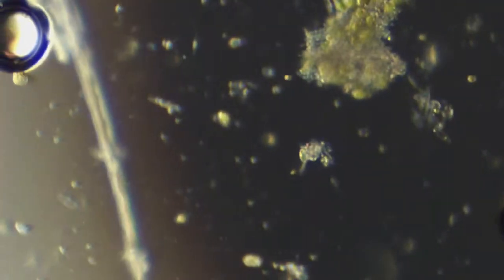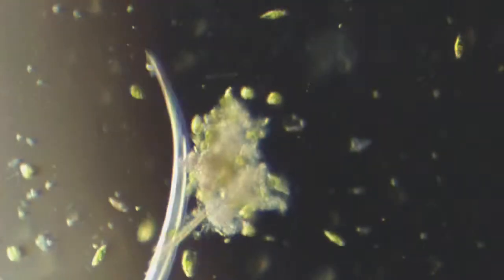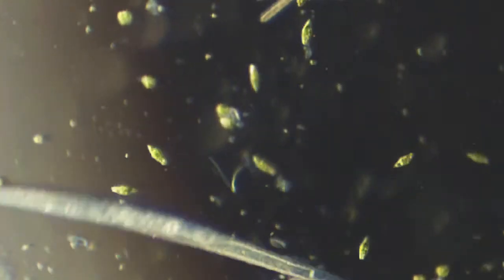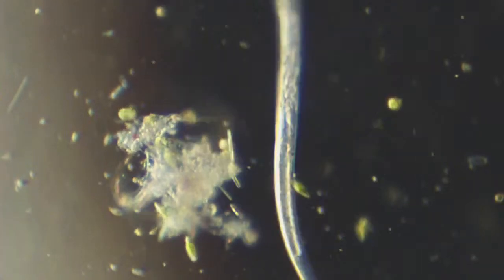So they just bat the hell out of everything around them. They're so big. So, of course, they're multicellular. Rotifers and tardigrades are around 1,000 cells. I forgot how many cells in a nematode. Probably about 1,000 as well, maybe a little more. Not a lot.